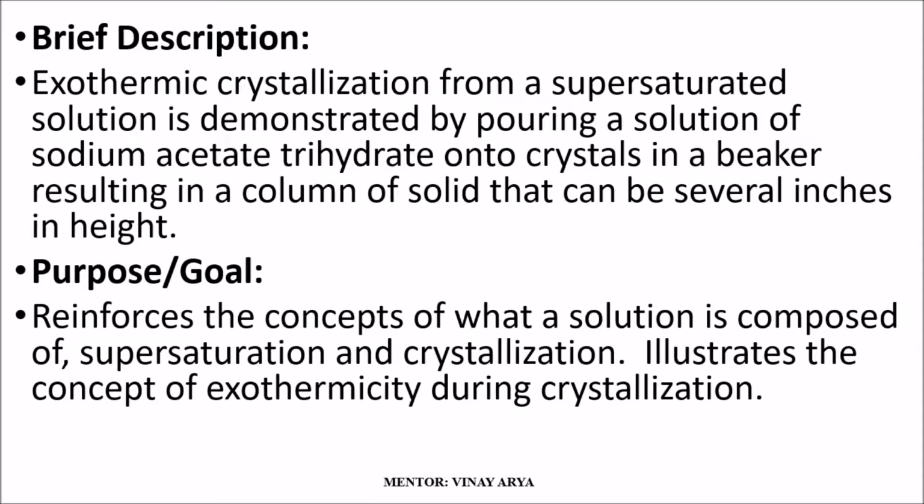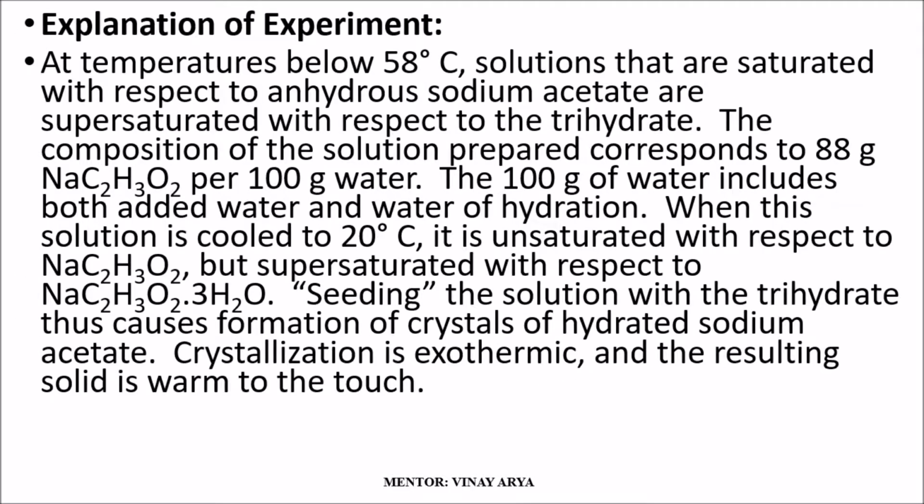trihydrate onto crystals in a beaker, resulting in a column of solid that can be several inches in height. The purpose or goal of this experiment is to reinforce the concepts of what a solution is composed of, supersaturation and crystallization, and to illustrate the concept of exothermicity during crystallization.